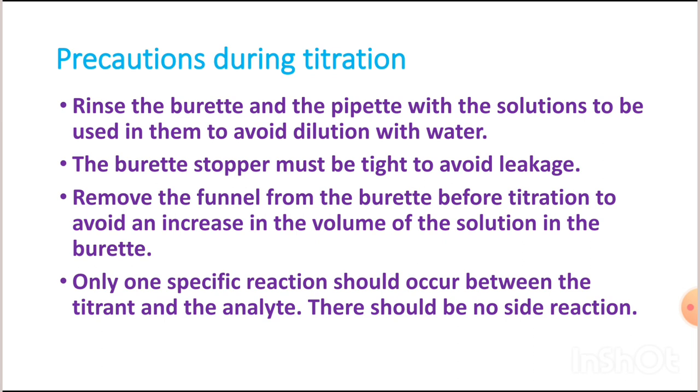Precautions during titration. First, rinse the burette and the pipette with the solutions to be used in them to avoid dilution with water. The burette stopper must be tight to avoid leakage. Remove the funnel from the burette before titration to avoid an increase in the volume of the solution in the burette. Only one specific reaction should occur between the titrant and the analyte. There should be no side reaction.